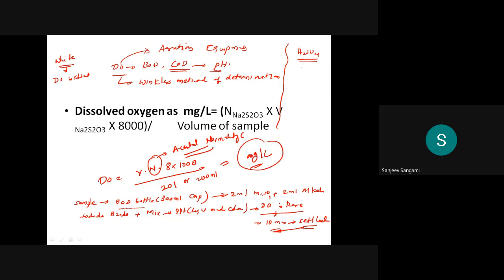Once it is dissolved, you are not supposed to find any particles inside that BOD bottle. It will turn to a wine red color.